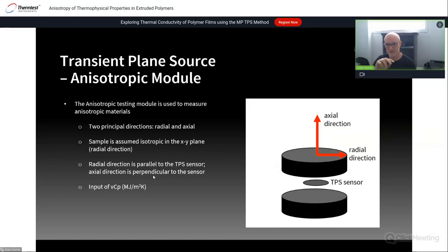At different penetration depths, which are defined by the length of time you measure, we measure the thermal diffusivity in both directions. We have a penetration depth that we want to make sure stays within the available boundaries. So if we can do different time scales, then certainly the assumption is met if that result stays stable.